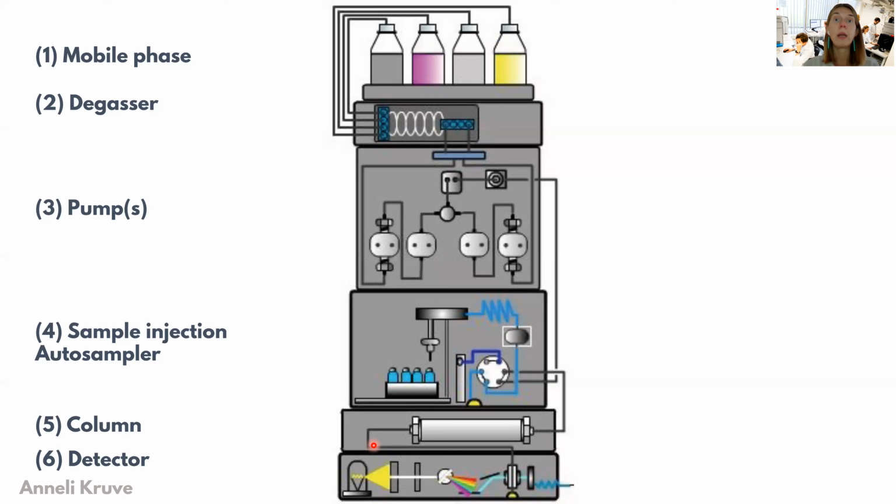this means that we can increase the temperature, and with this get more efficient separation, so get lower theoretical plate heights, higher theoretical plate numbers. So from this point of view, it's preferential, but we need to keep in mind what is the stability of our samples.